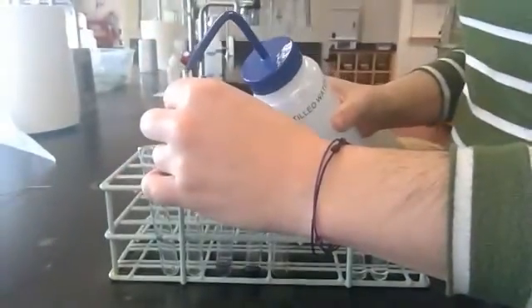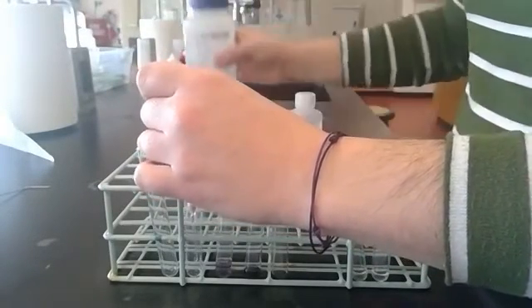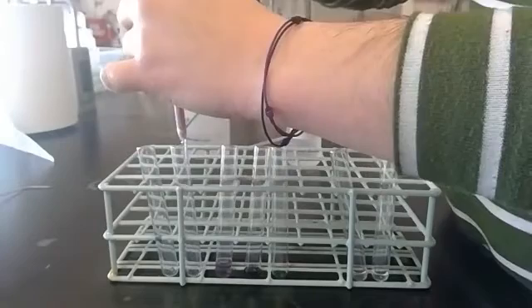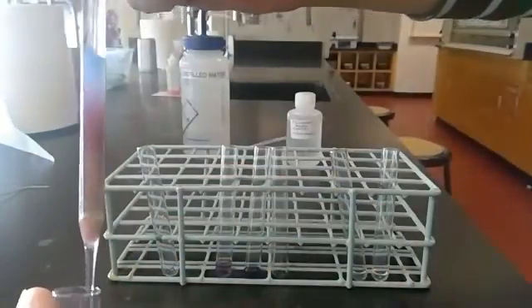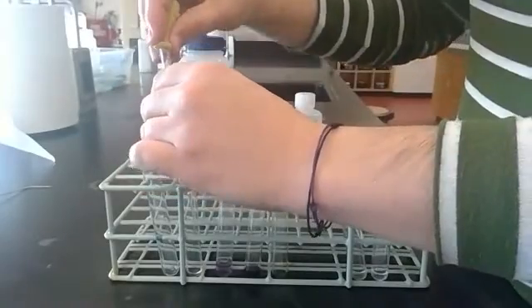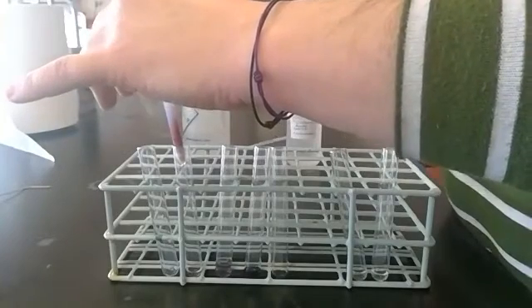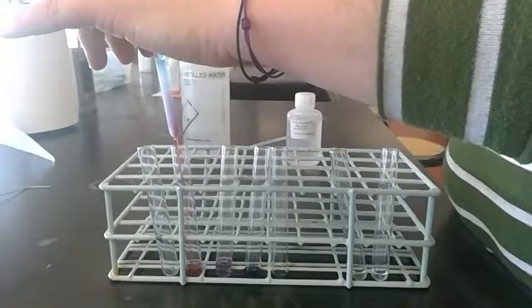So what we're doing is we were using a less polar solvent, right? And now we're going to use a much more polar solvent, water, through our column, and we're going to see what color comes out. Again, applying some slight pressure. You can see how there's actually now, there's like a brownish red, a rust red, and then kind of a magenta, then another layer of blue coming behind it. Because some of the dye stayed on the top of the silica gel. Might have actually been a little bit of solid, honestly. And here comes our red color through with our water.